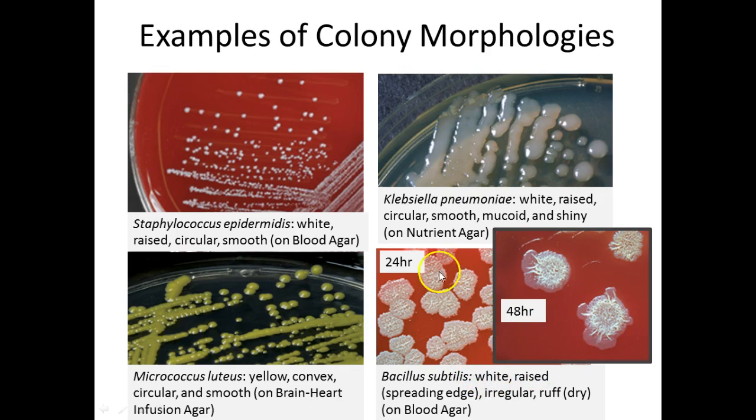It's raised, but look at even how time affects it, which you can definitely see with our Klebsiella, right? Those were done Wednesday, so they're over a week old, right? So some of these organisms are screaming to get out of the fallout shelter right now, right? They're like, please rescue me. But you see how it's irregular, right? And you have these different layers even forming here. So, use your good scientific skill of observation and recording and observing these things.